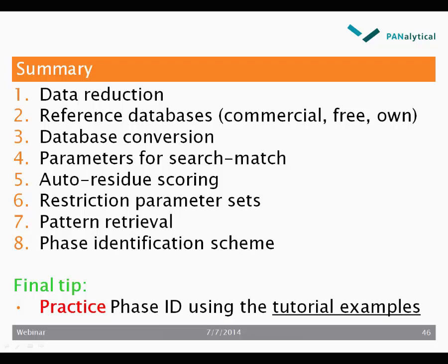Phase ID is not an exact science. It is more something like a craft. Practicing helps a lot, and by running through the tutorials you will gain confidence and learn how to use HighScore better and faster.